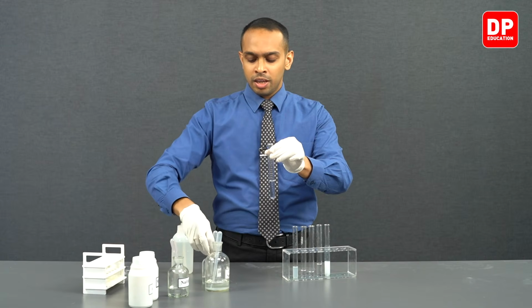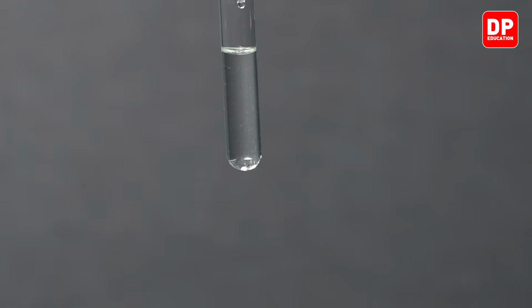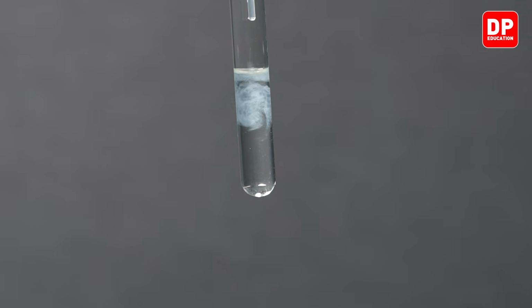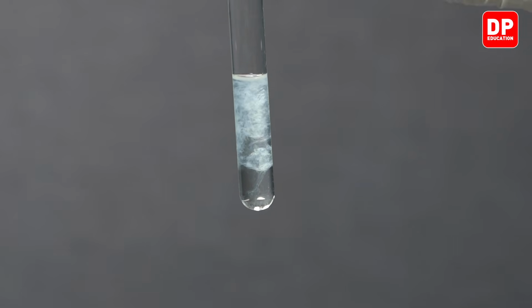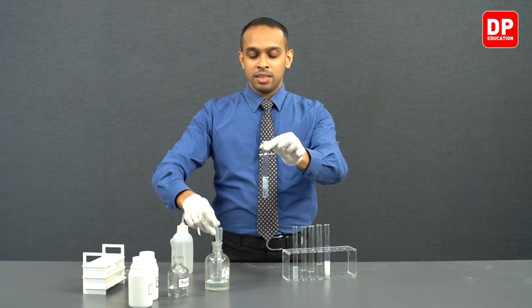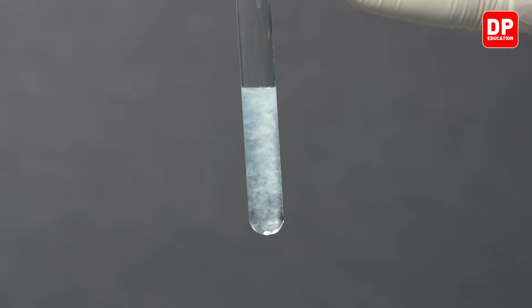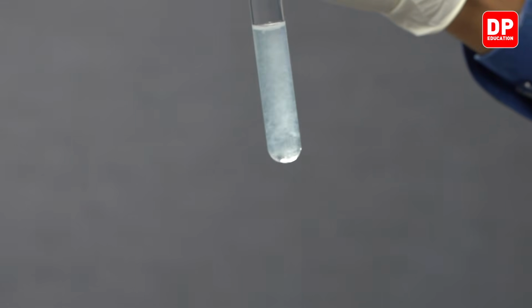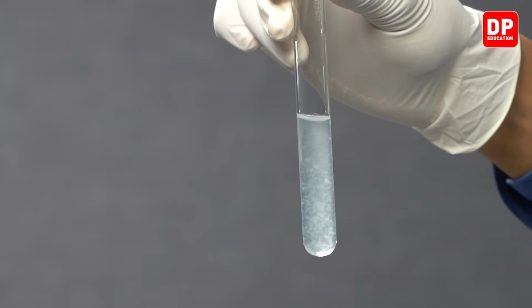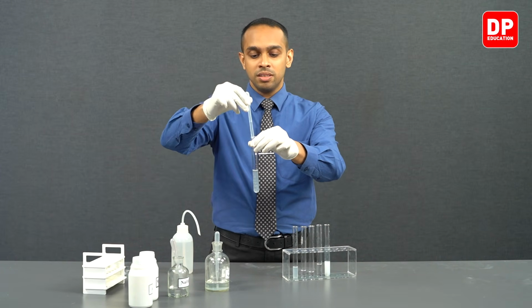What will happen if we add HCl and acidify the medium once more? You can see as we acidify the medium once more, we form aluminium hydroxide again. And if you add enough and more HCl, this formed aluminium hydroxide will again dissolve to form a clear solution. As you know, aluminium hydroxide is soluble in HCl. So let's observe that as well.